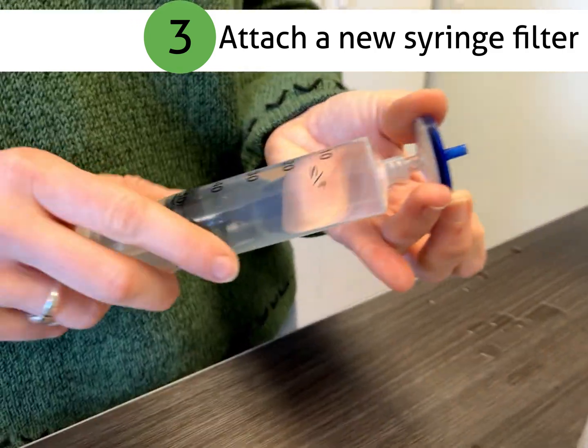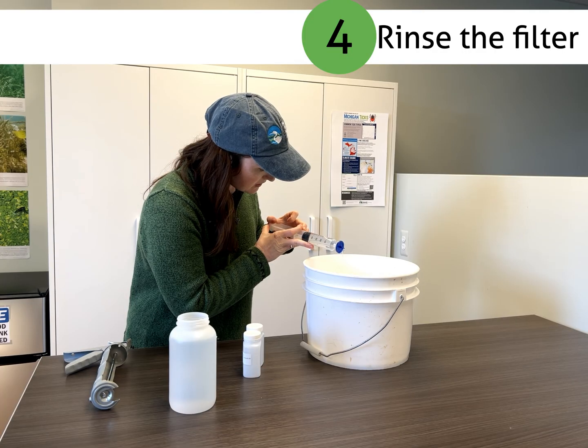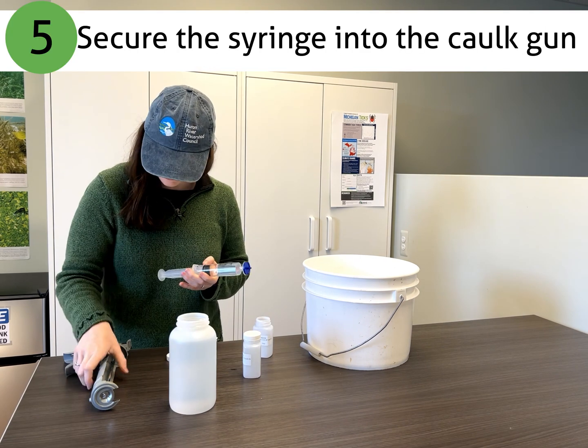Now attach a new syringe filter to the syringe, and try not to touch the tip of either the syringe or the filter. Then rinse the filter by pushing 3 to 5 ml through the filter.